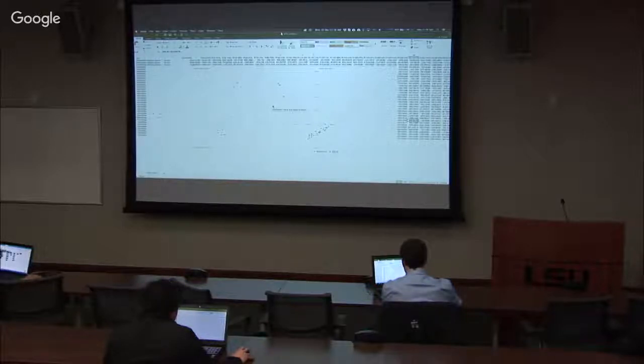And now you can either do PCA here, you can already connect. You don't need to change anything, click on save. And now name your pipeline. Everybody else is good?